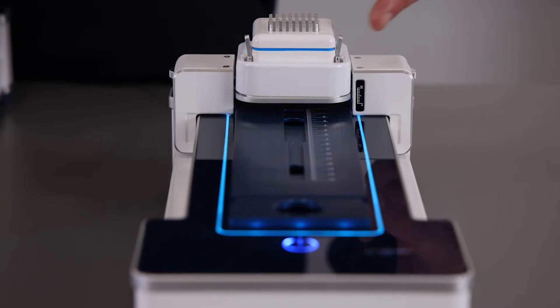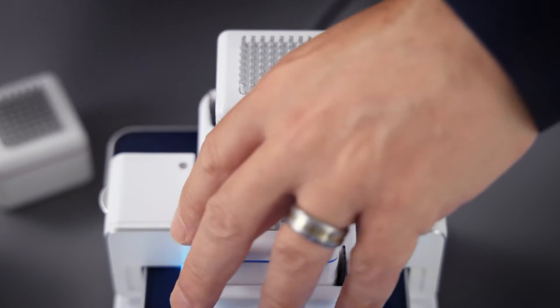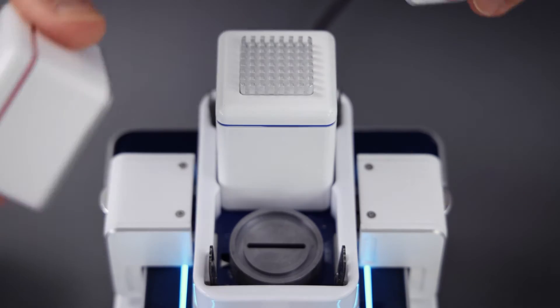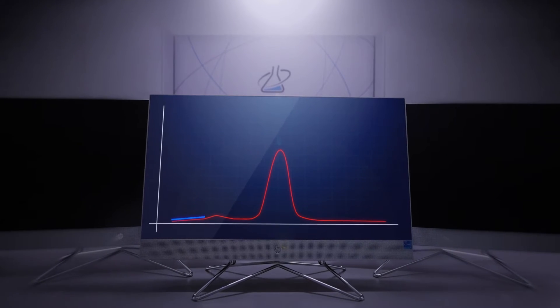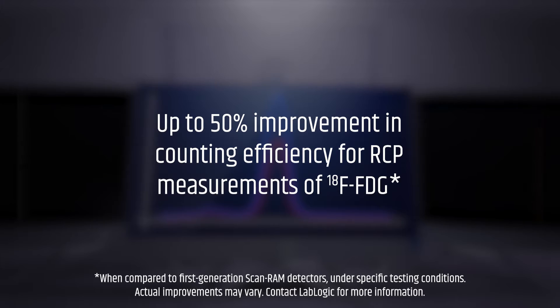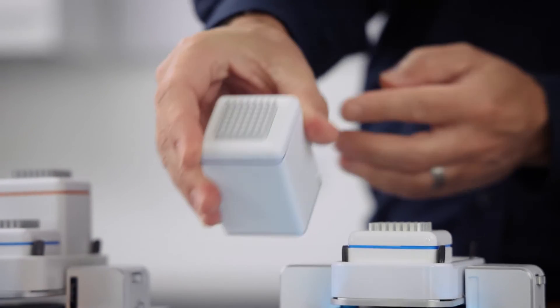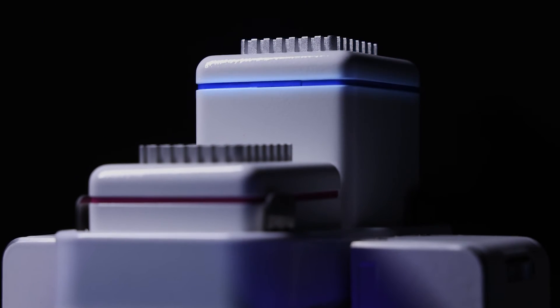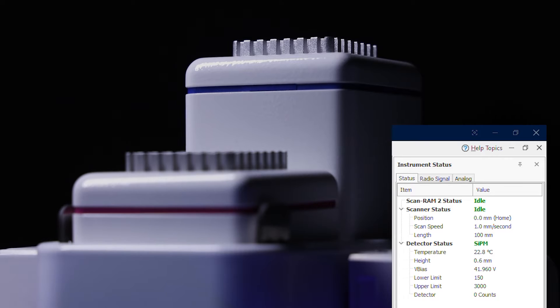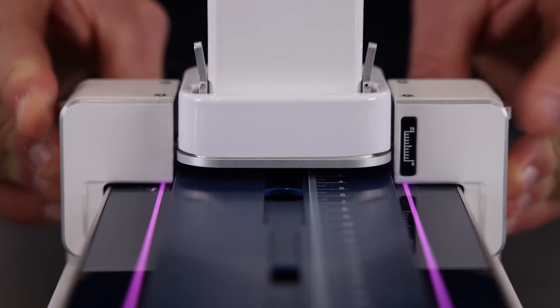The standard ScanRAM is a single detector radio TLC scanner which provides accurate results for radiochemical purity testing. A range of detectors are used with a ScanRAM to maximize performance across different nuclear medicine applications. The latest detectors have improved sensitivity compared to traditional systems and include silicon photomultipliers with Peltier cooling for consistent performance. They are interchangeable, automatically recognized, and optimized depending on the radionuclide being detected. Collimators are easily changed and adjustable for maximum flexibility.